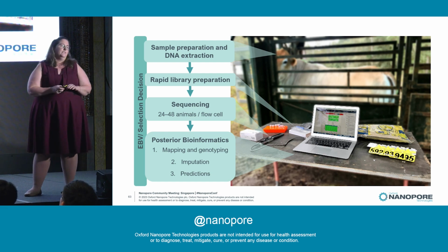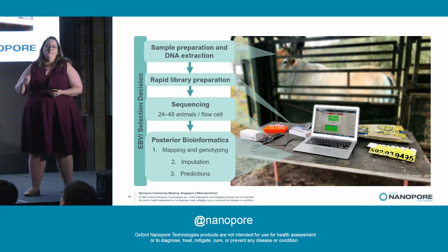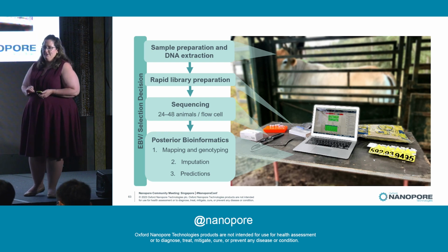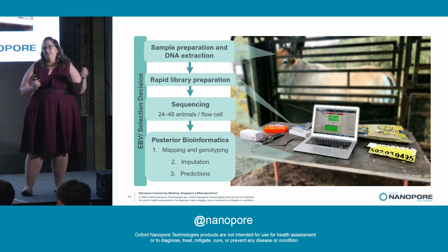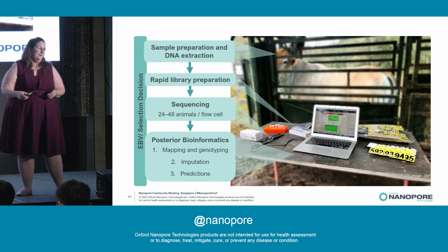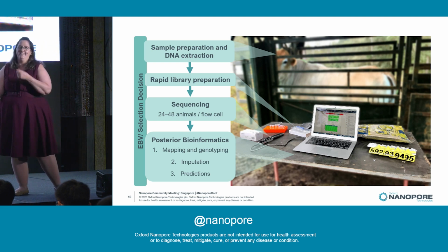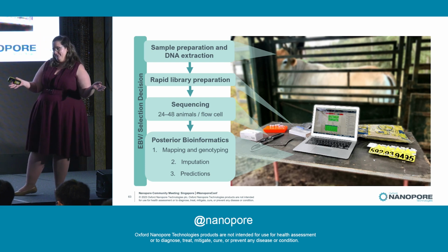Currently, if you want to perform genomic prediction on a cow, you will take an ear sample or pull out some tail hair, and you will pop that in the post, and you will send it away to a commercial sequencing provider. So it spends about 2 weeks in the post trying to get there. And then it gets to the lab, and then it kind of sits on the bench for a while. And they finally open the tube, and they genotype them. And they send you the results back a couple of weeks later. So you're looking at a 6 to 8 week turnaround.